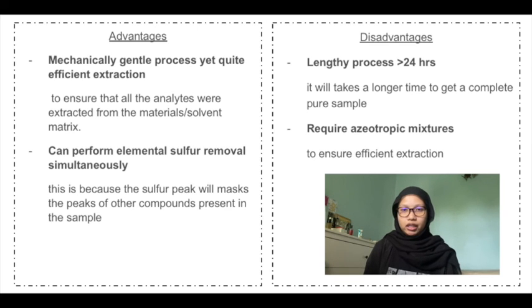The second disadvantage is that it requires azeotropic mixtures. This is to ensure that there is efficient extraction and also to get good results.